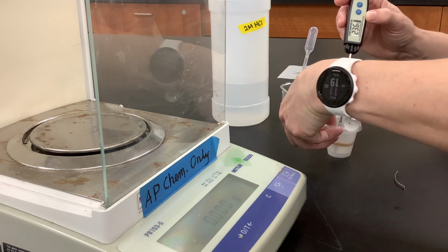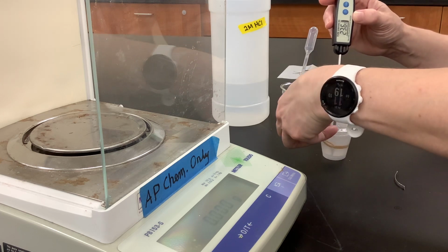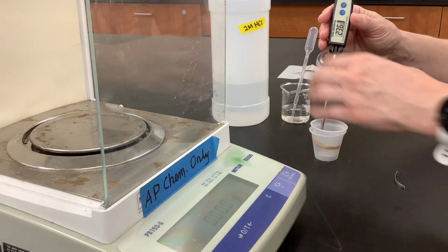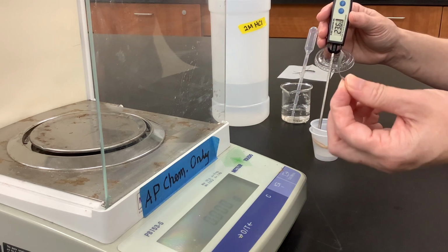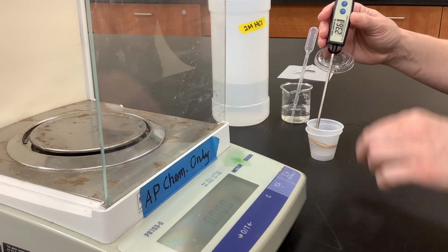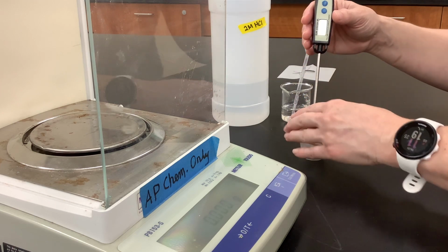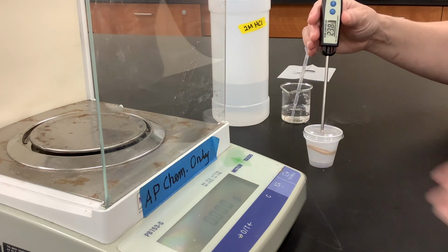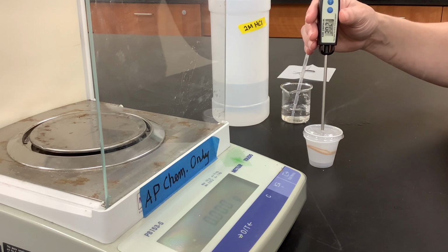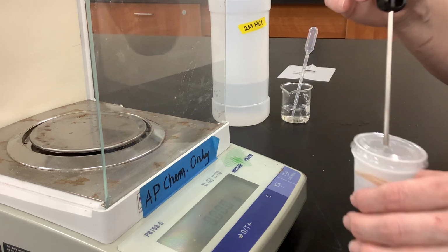Then what I'm going to do, guys, is open up the lid, just like I've done in other laboratories, and quickly add the magnesium to the container. I'm going to fold it in half a little so it submerges completely. Then I'm going to quickly add that metal. As you can see, there are gases being released. There's lots of bubbling.